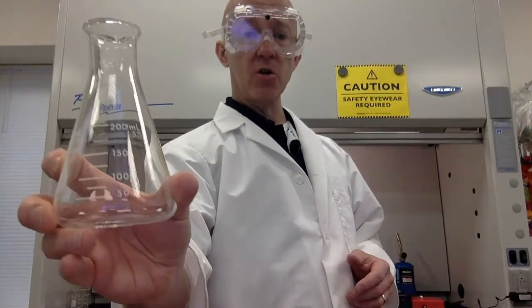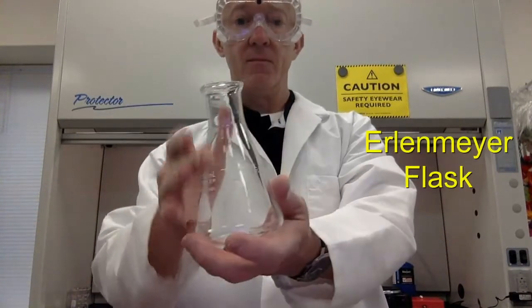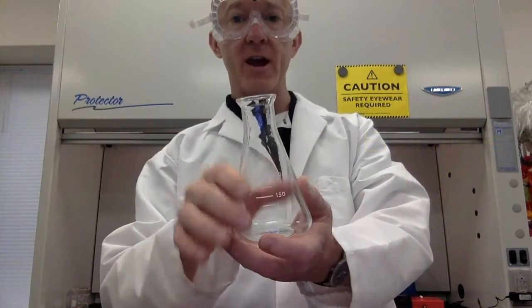If you do expect it to be a little more vigorous, then we use the Erlenmeyer flask. Notice the conical shape, and that prevents anything from splattering out when you're mixing.